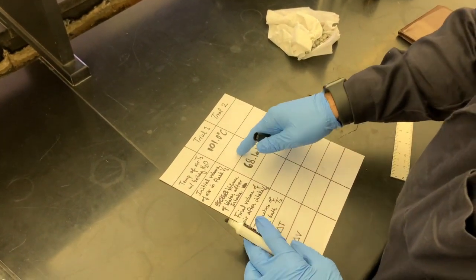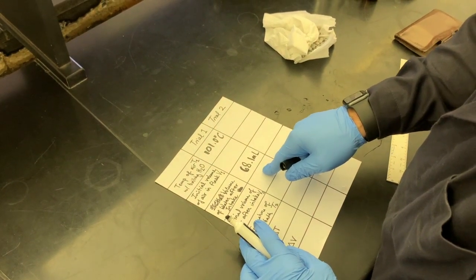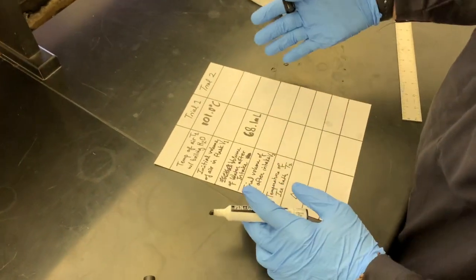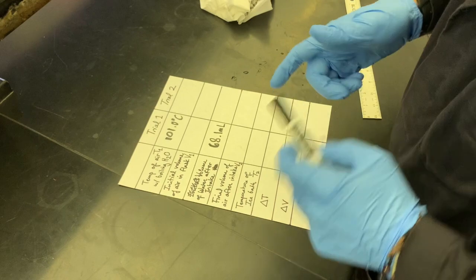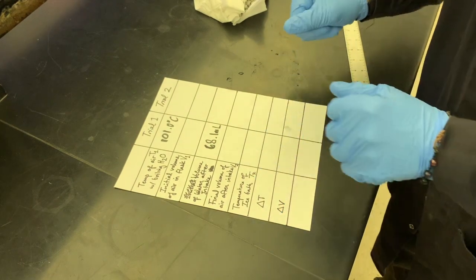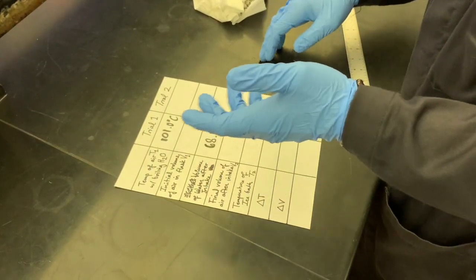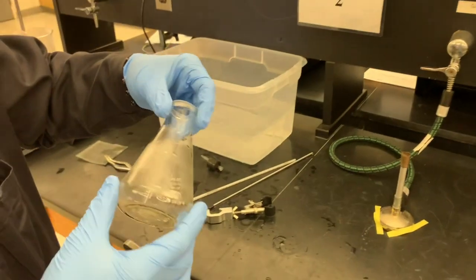Now we still have two important missing spots here. We have the initial volume of air in the flask, and we have the final volume of air after the intake. Those are the numbers that actually matter, V1 and V2. The way we're gonna get those is we're gonna first find the full volume of the flask. Since the flask we had to have dry before is wet already, if you're gonna use the same flask, you don't really need to do this twice, but you can, never hurts. In order to keep this straightforward, I'm just gonna do that part once.